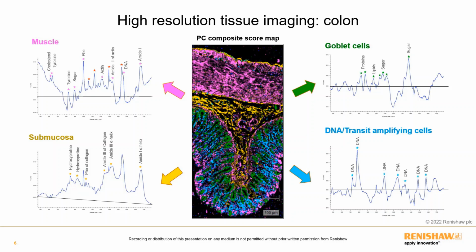The high resolution which can be achieved with Raman imaging enables tissue structures to be accurately labelled. The application of multivariate data analysis techniques such as principal component analysis and linear discriminant analysis are methods which are commonly used when performing classification of disease in different samples. And we will see this applied later on using the Renishaw data classifier.